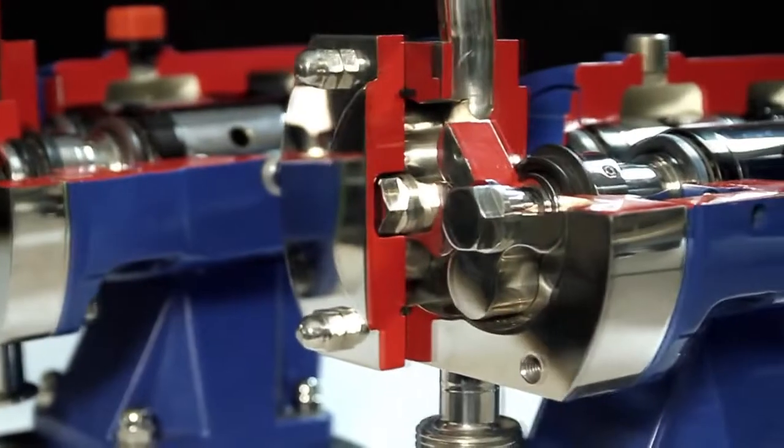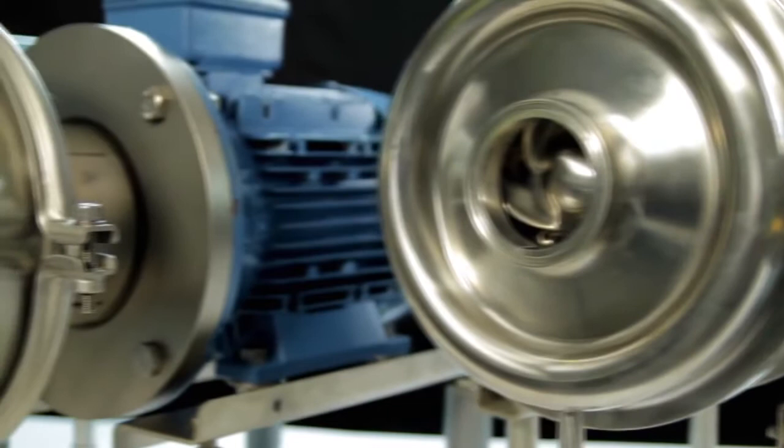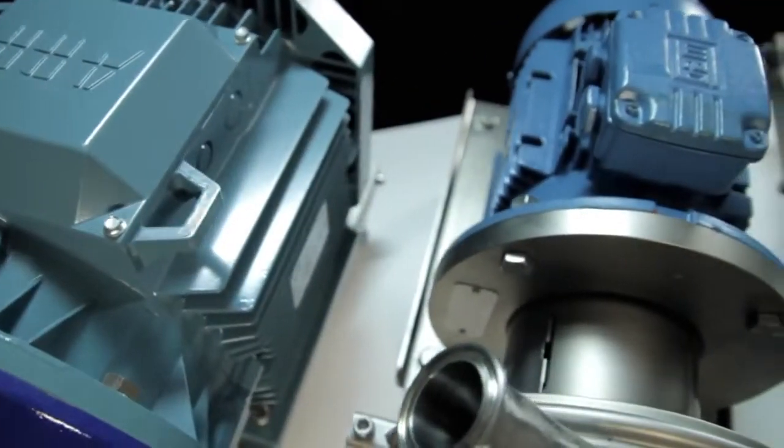Comprehensive range. Optimized performance. Hygienic, contamination-safe design. Expert documentation.